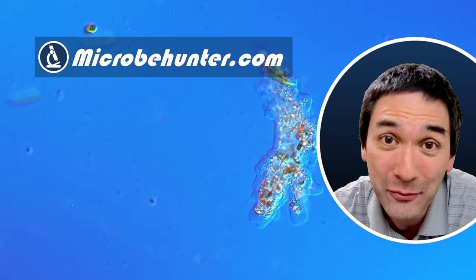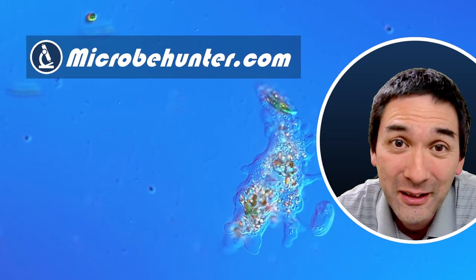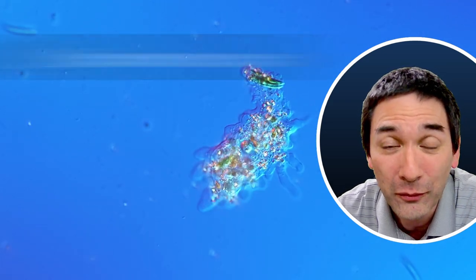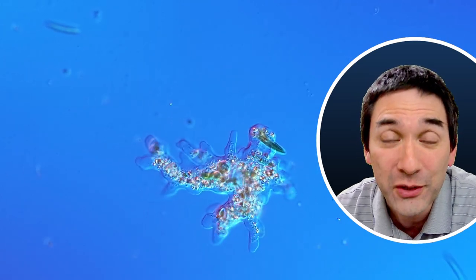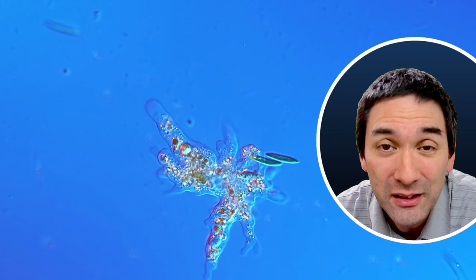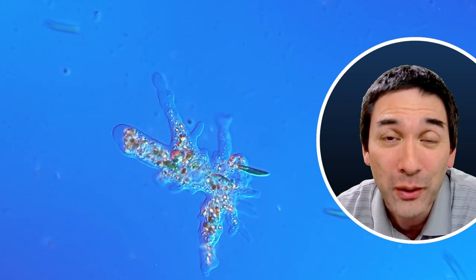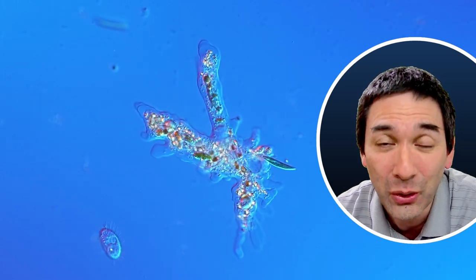And today under the microscope already the first microbe, an amoeba, of course in time-lapse. And if you're interested in watching the full version of all of those videos then please have a look into the description because this is where I placed the links to all of the videos that I'm going to show you a summary today.